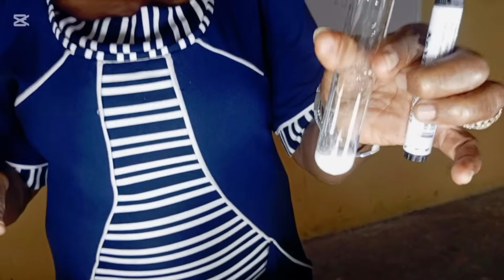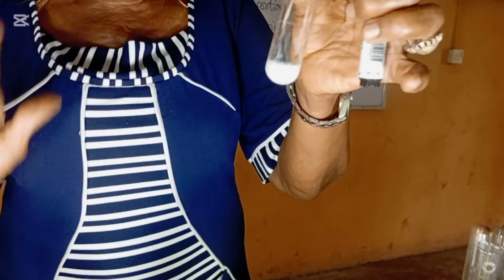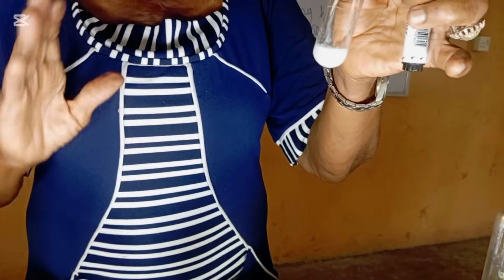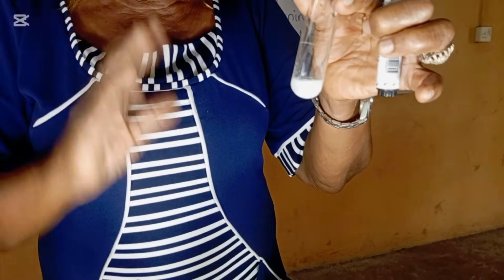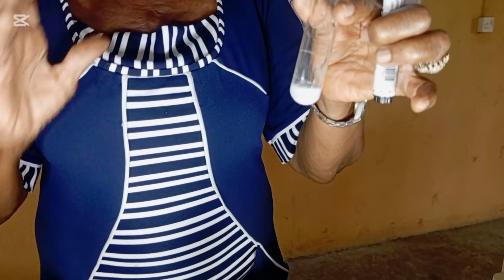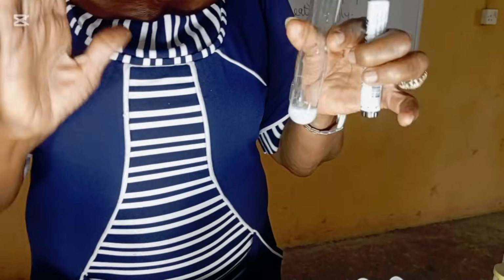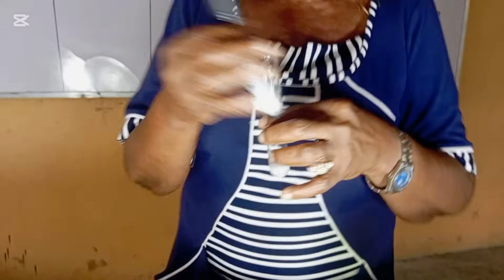I've added in drops. You can see it has given us white PPT. Please don't say gelatinous. If you say gelatinous, no score. There's a difference between white PPT and white gelatinous PPT. So what I have here is white PPT, which is white precipitate.